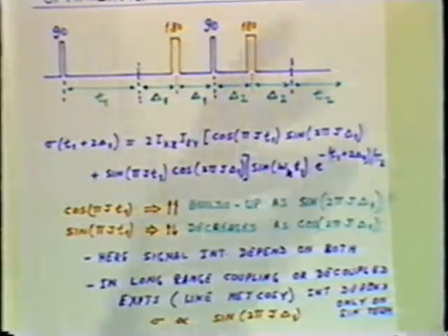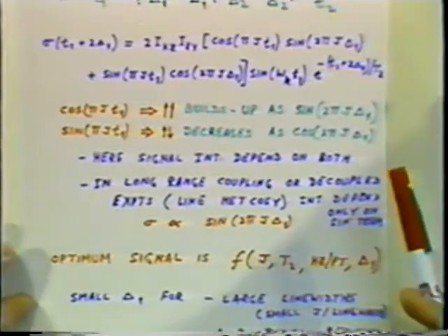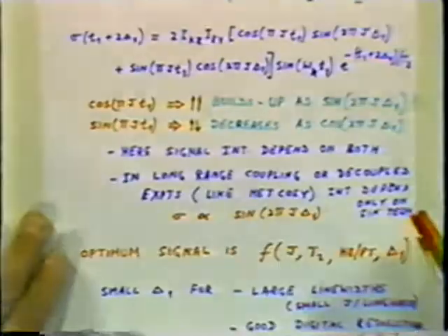And that's basically the difference between a delay COSY, which is done for long range coupling, or a super COSY which may be done even for not so long range coupling. It should be done even for normal couplings. Actually, in standard COSY algorithms nowadays that you get from vendors or machine manufacturers, a little bit of delay is very generally introduced during T1 period. Okay.